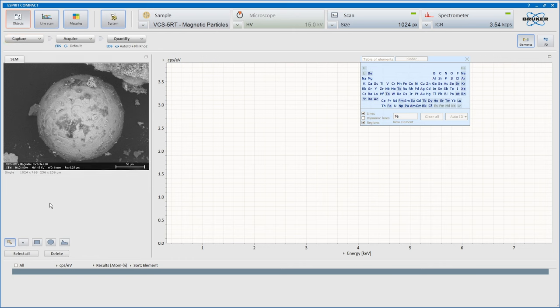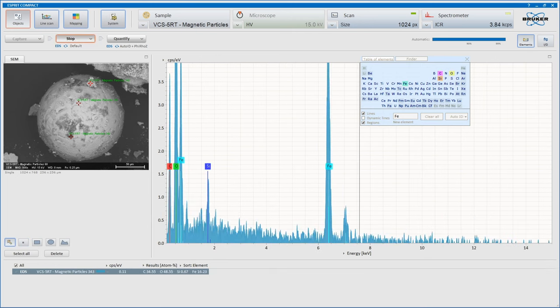Okay, so now we should be able to get a better number of samples per second on our analysis. So we'll go back there and we will choose this one. And this I think probably might be copper. We'll see. Something higher anyway, and we'll go acquire. So as I predicted before, iron, silicon and carbon. And obviously with the oxygen.